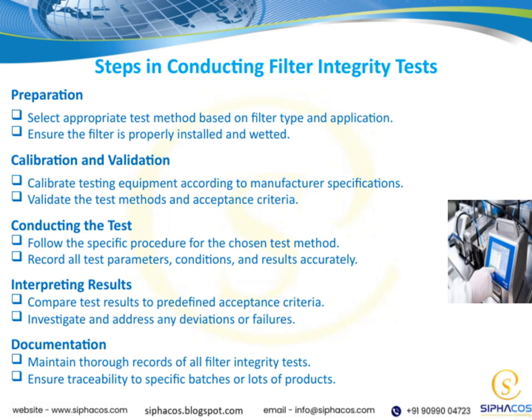Moving on to calibration and validation. Always calibrate your testing equipment according to the manufacturer's specifications to ensure precision. It's equally important to validate your test methods and acceptance criteria regularly, so you know your results are reliable and consistent over time. When conducting the test itself, follow the specific procedure outlined for the chosen method.